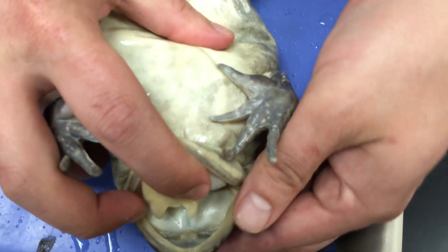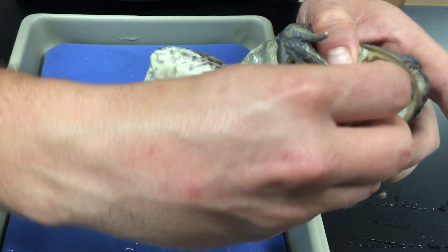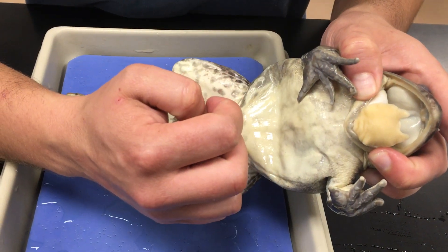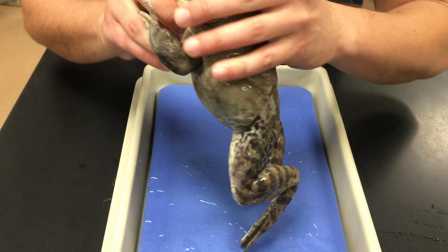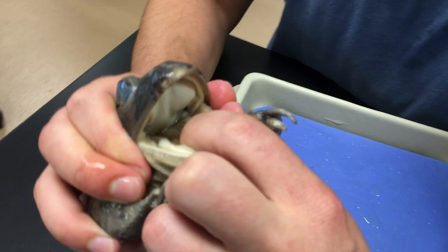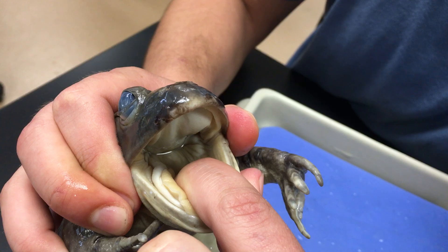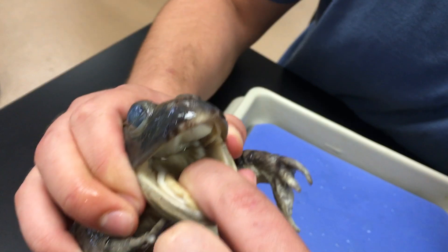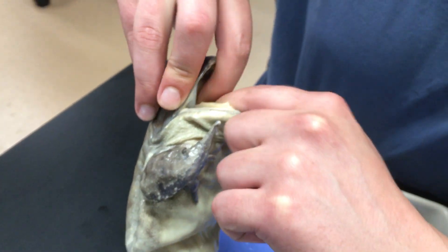On the floor of the mouth we have the tongue. Interestingly, bullfrogs have their tongues attached at the front, where you, for example, have your tongue attached from the back, and that tongue will just flop out — that's how they capture prey. Looking way inside the mouth, we can see the large opening at the back of the throat, which is the esophagus. Bullfrogs are voracious predators; they'll eat anything they can swallow, and you would be surprised at the kinds of things they can swallow.